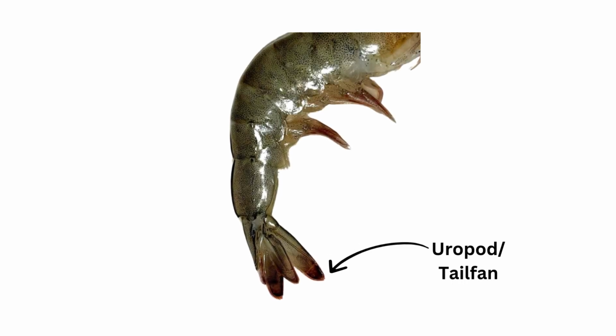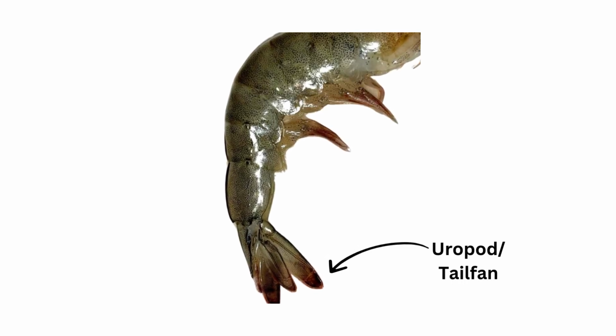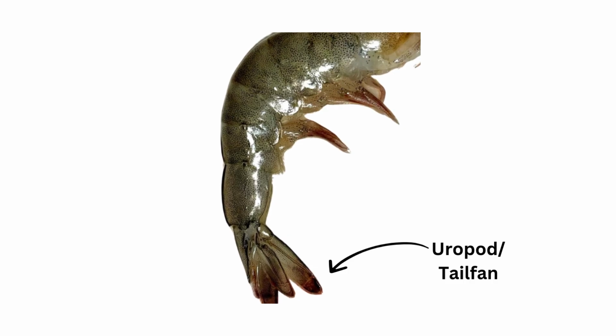Uropods or tail fan. The uropods are the flat, fan-like appendages on either side of the telson. Together with the telson, they form the tail fan, which the shrimp uses to dart backward quickly, a common escape response. The uropods help with the boat movement and stability in the water.